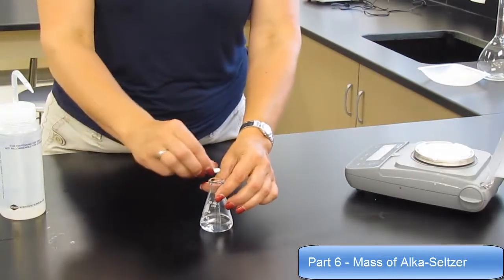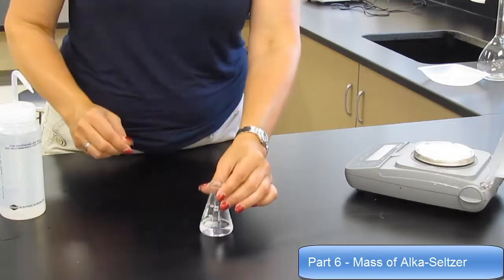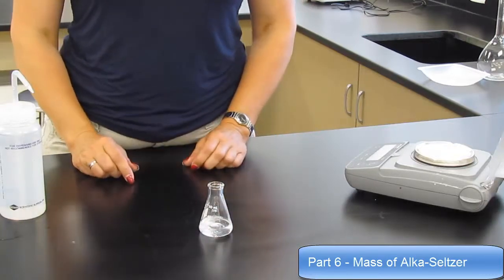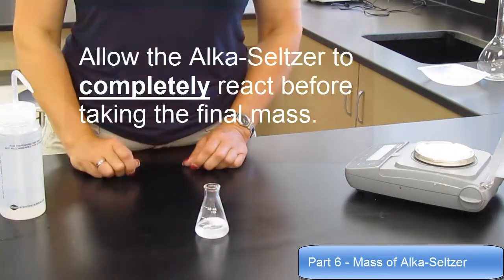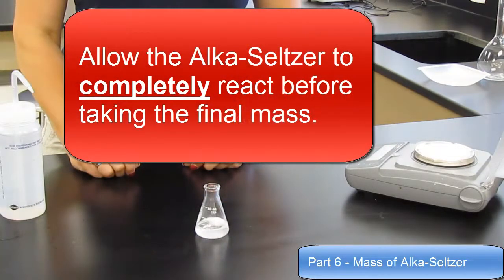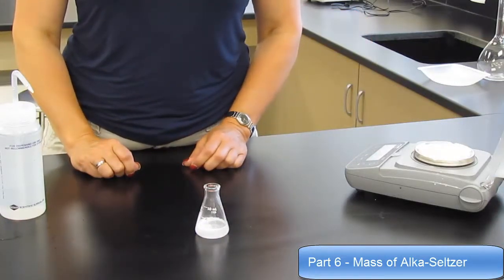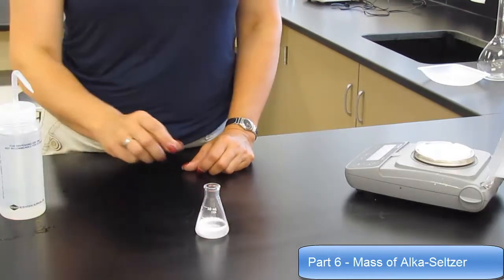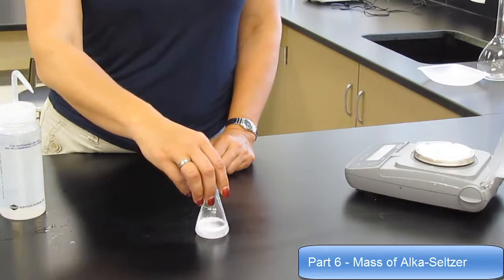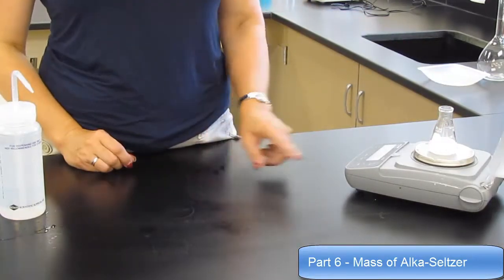Then take your Alka-Seltzer and place it into your Erlenmeyer flask. Now this is going to take a little while, but allow it to continue to finish reacting. Make sure you make some observations during this point. Allow the Alka-Seltzer to completely react. Then, once it's completely reacted, put the container back on the balance and take a final mass.